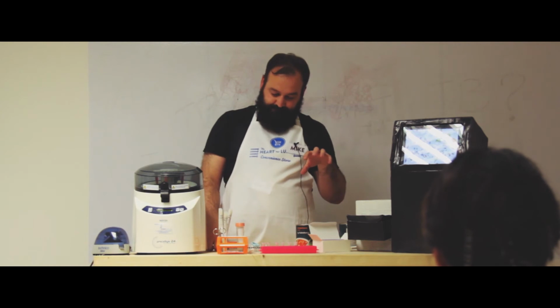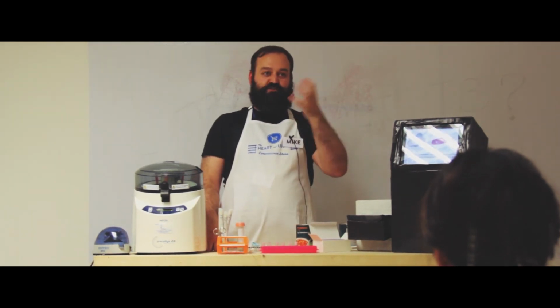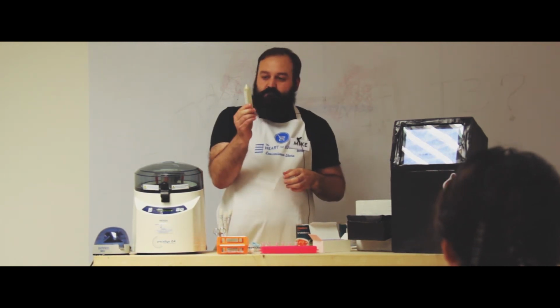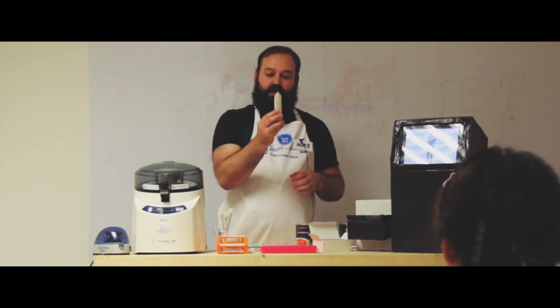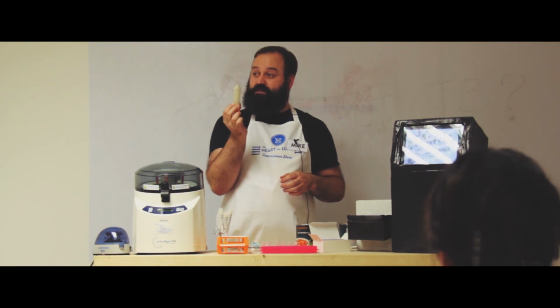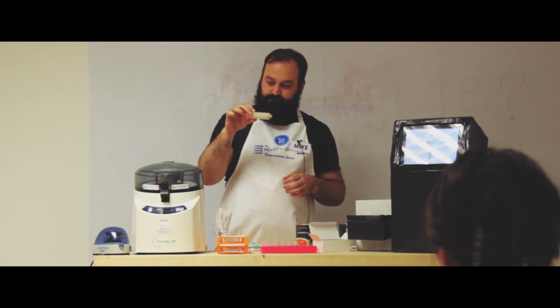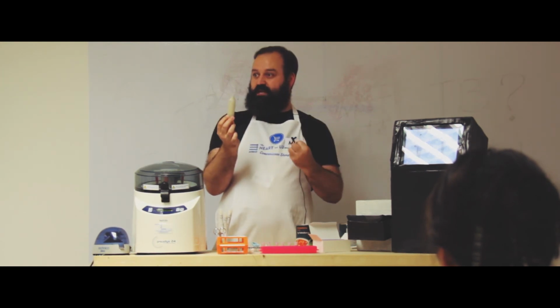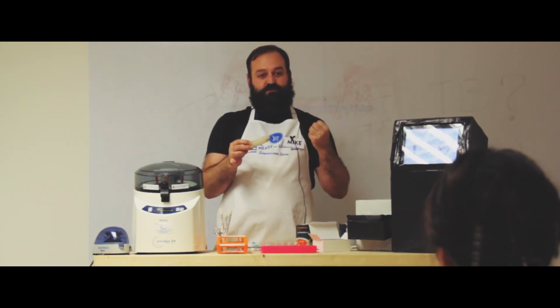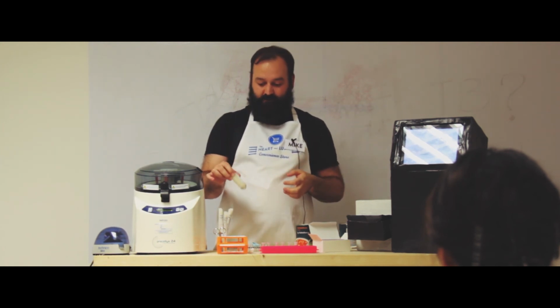The next step is that we want to capture the DNA itself. We've got the soup there, we've got some of the veggies left, and we've got the pasta shapes. And this substance is a binding matrix. It's a very fine sand which will specifically bind to DNA. I mix the sample in with this. The binding matrix pulls the DNA out, and I can centrifuge it again, and that all goes down to the bottom. So I've captured the DNA out of the sample, and I've thrown away the rest of the soup now.